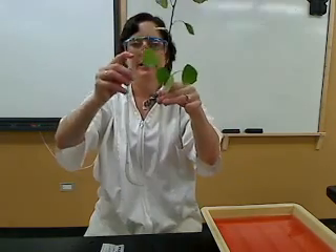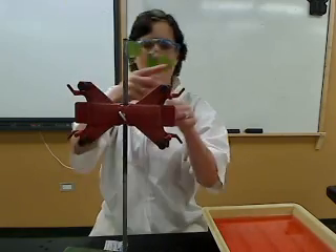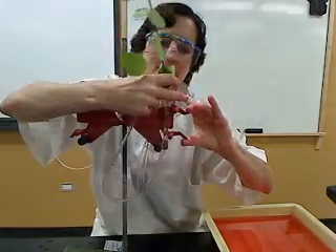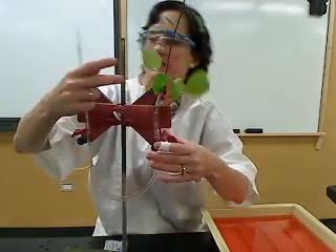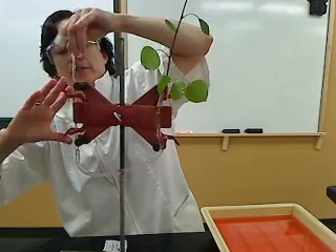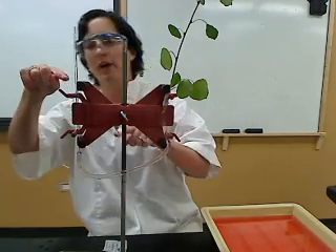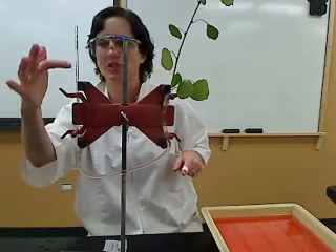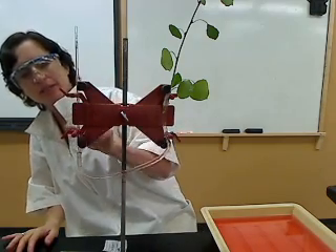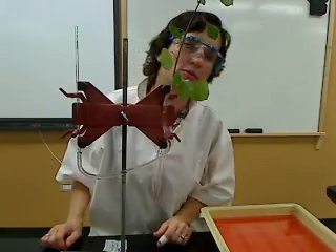You want to have uninterrupted water through the tubing. To observe transpiration, we're going to use a ring stand with some clamps. These ring stands are really convenient because they have two-sided clamps — you can put one end on this side and one end on the other. You'll want to see the water level going down the tubing; it's calibrated with marks so you can collect data and time how long it takes. The only reason the water moves is because it's going up through the plant and out through the stomates of the leaves. This is the general setup for the potometer.